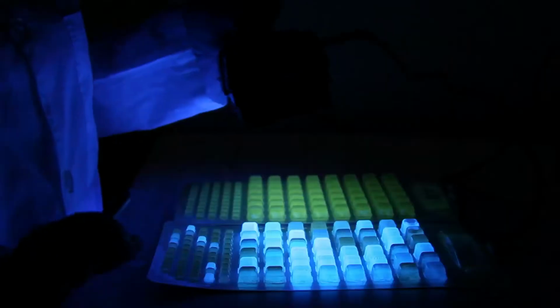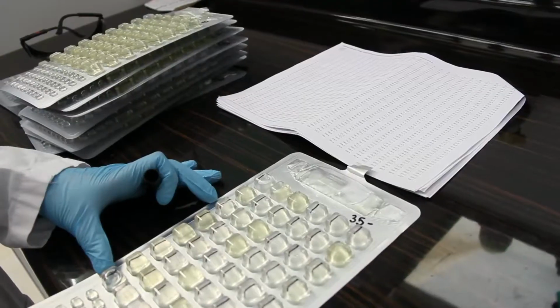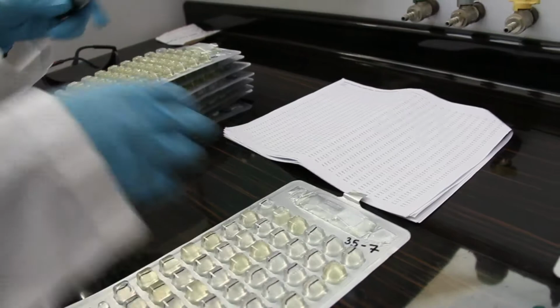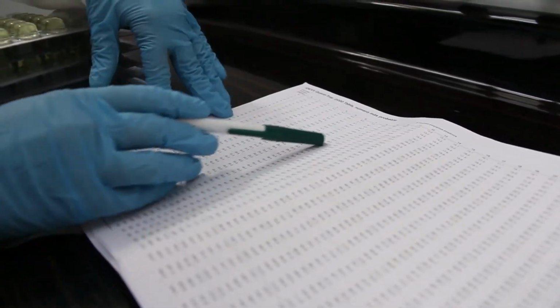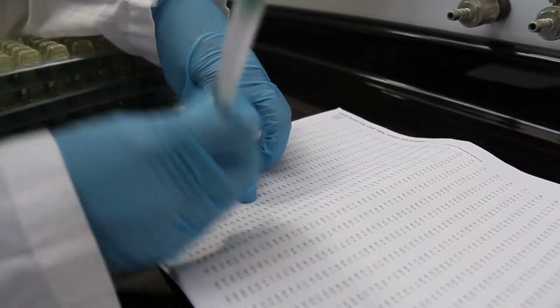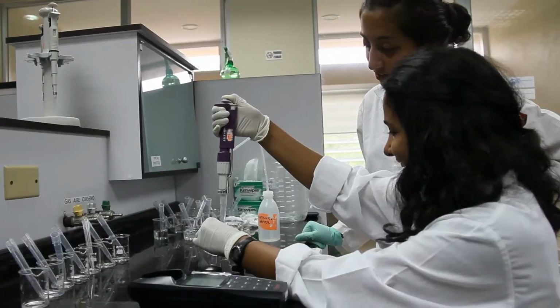Right now, we're looking at the wells that light up with the UV light. This means that there is presence of Enterococcus or fecal coliforms within the water sample that it was taken from. Then we look at this sheet and find the number of small wells and join it to the number of large wells, which for this is 70, meaning that this is the number of colony forming units within that sample.